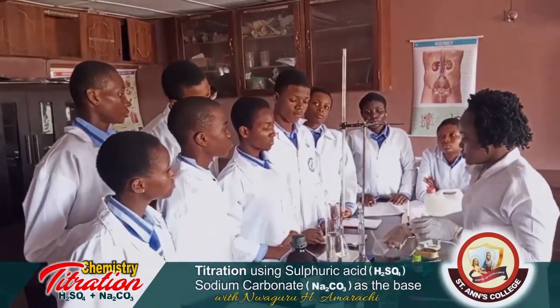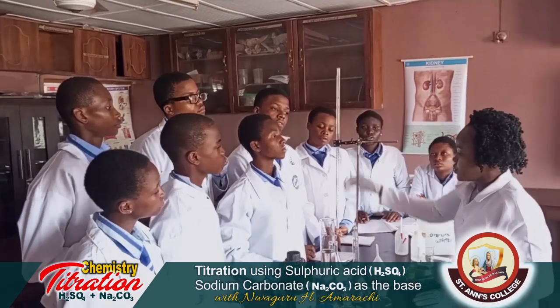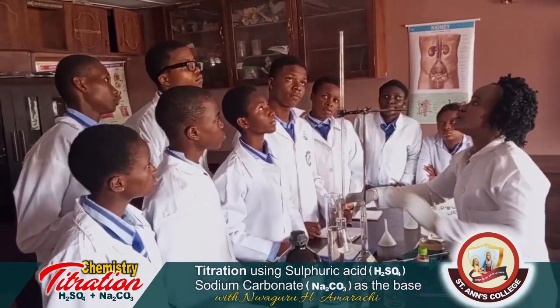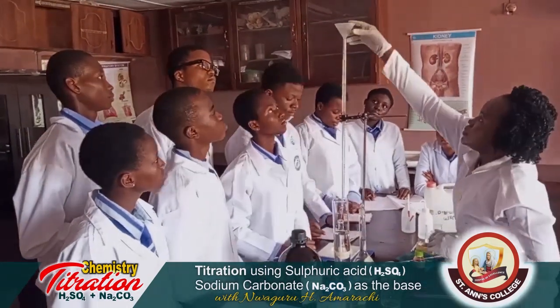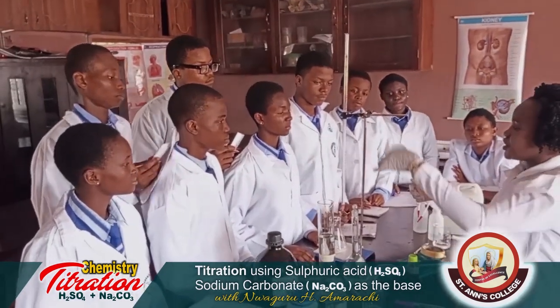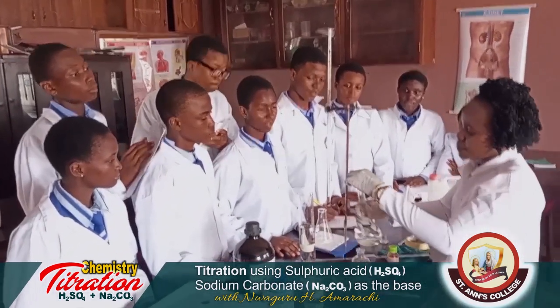Now, at this level, you have to reduce the level of the acid inside the burette to come down to this 0 point by using the knob clip and watch. Remember to remove your funnel before carrying out your practical, because even a drop from the funnel can add to the burette reading. Let's pick our what? Base.